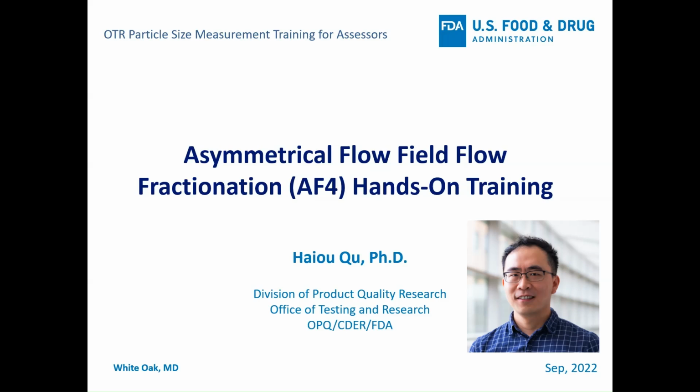Pharmaceutical companies also start to realize the value of this technique. Some of them use it for their preclinical study to improve their formulation, and some companies use it for their generic product, to generate the data to demonstrate comparable physical chemical properties.